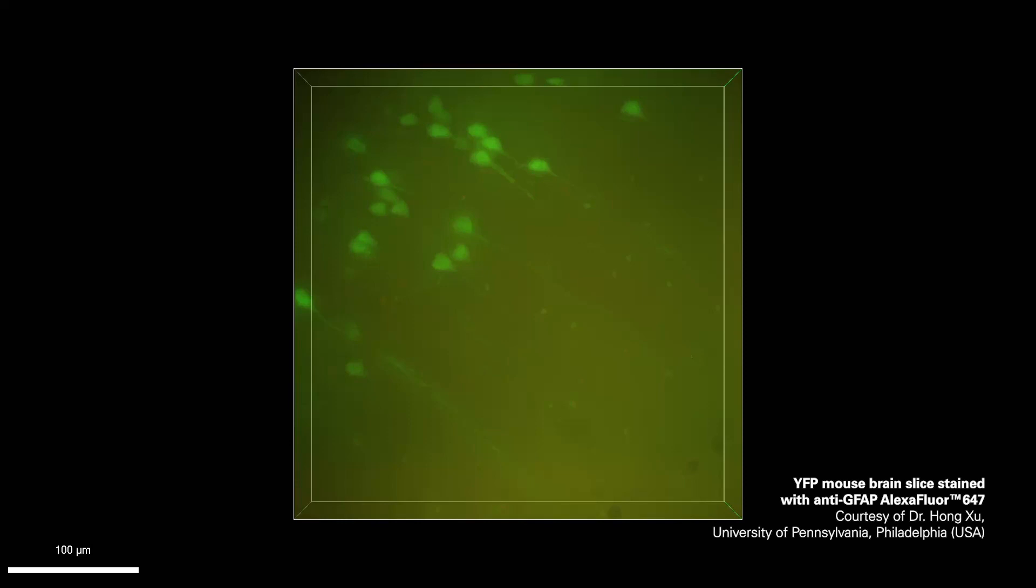If you image a brain slice on a wide-field microscope, for example to follow an axon or neurites of neuronal cells, you typically get a blurry image. The deeper you go inside, the much more out-of-focus light you gain.